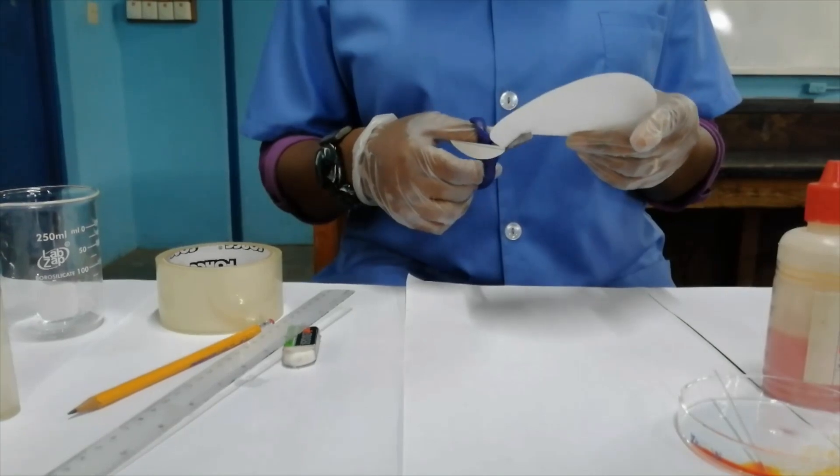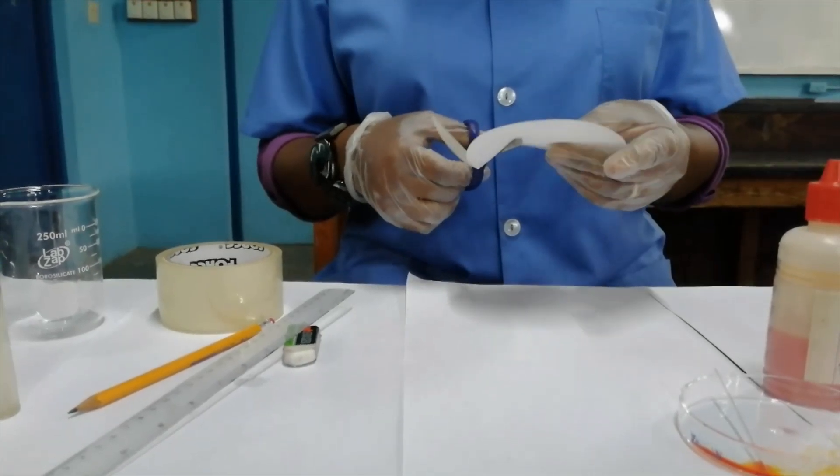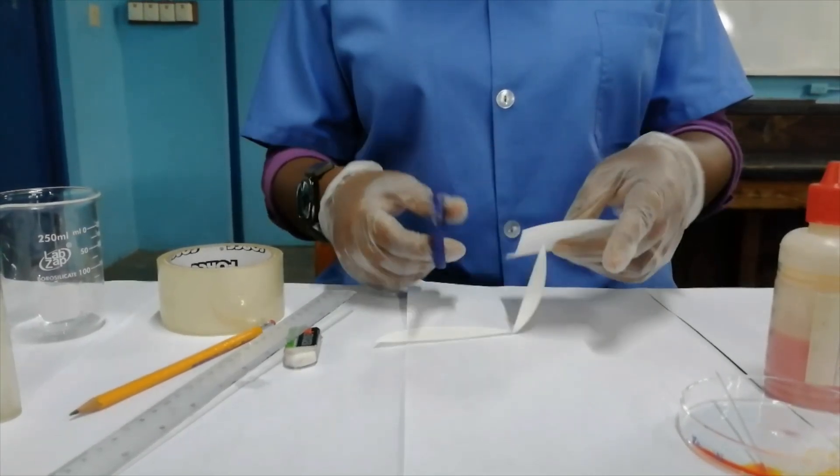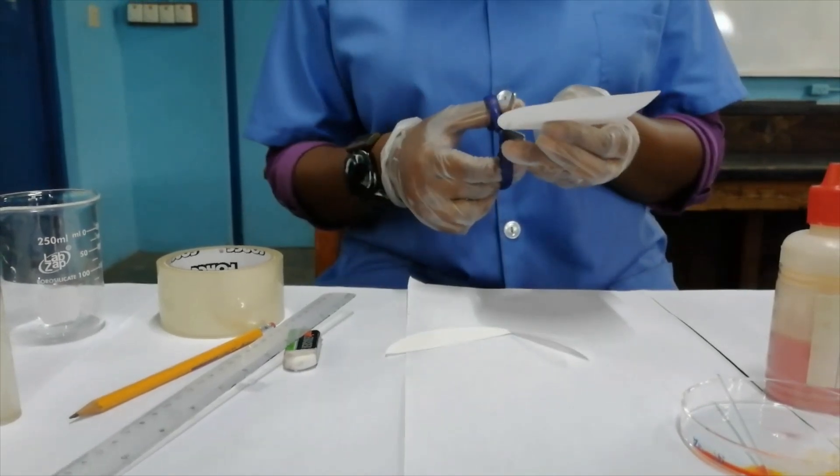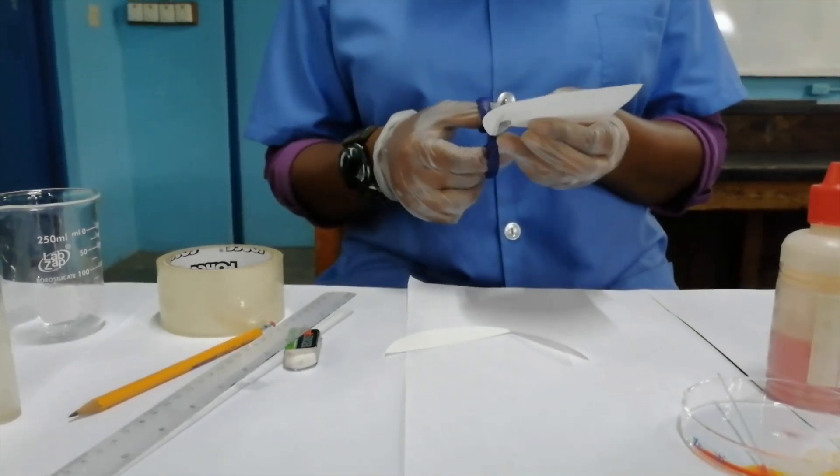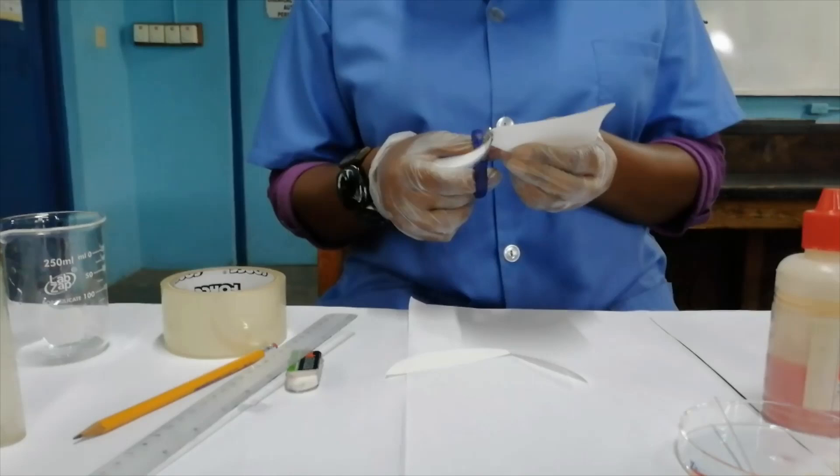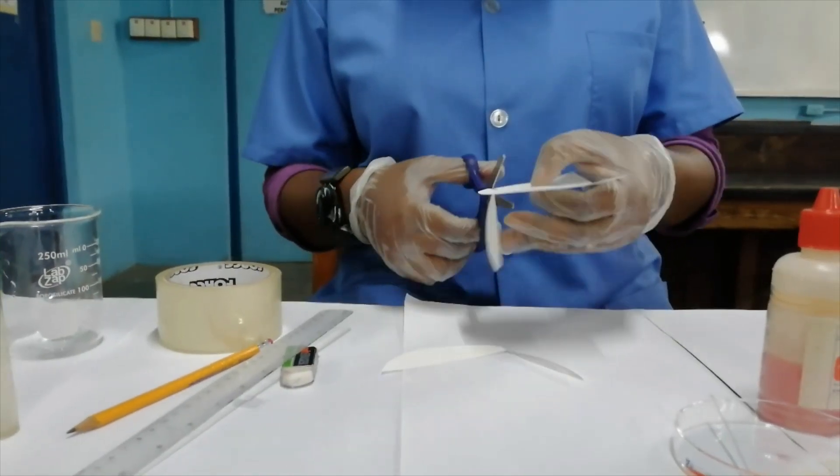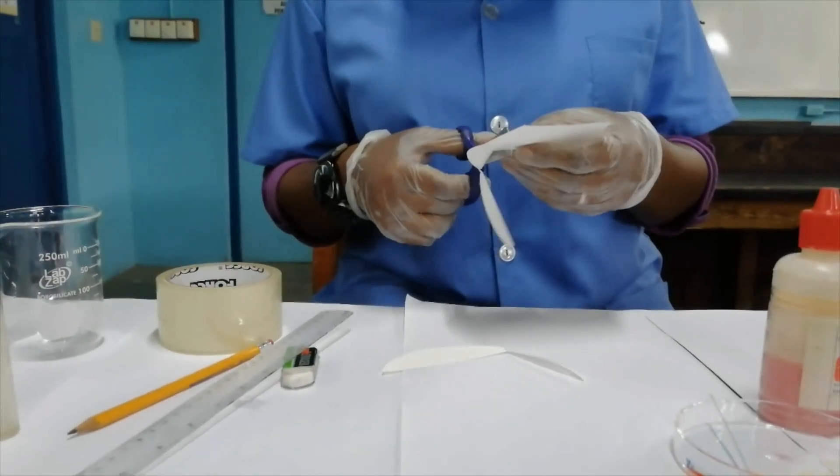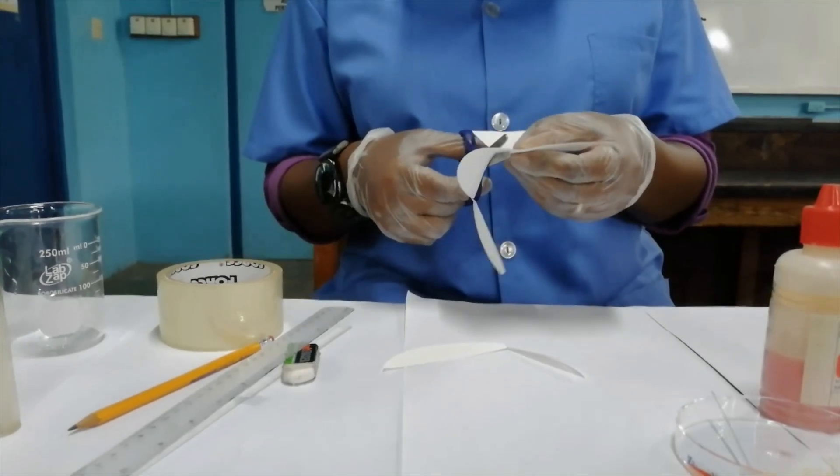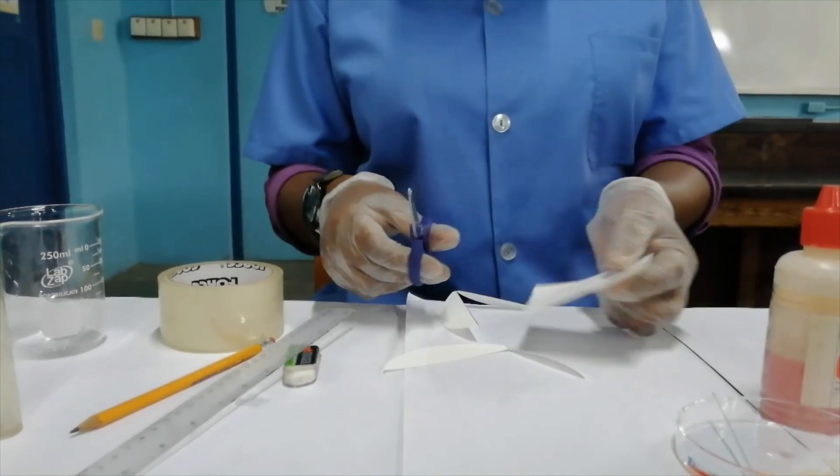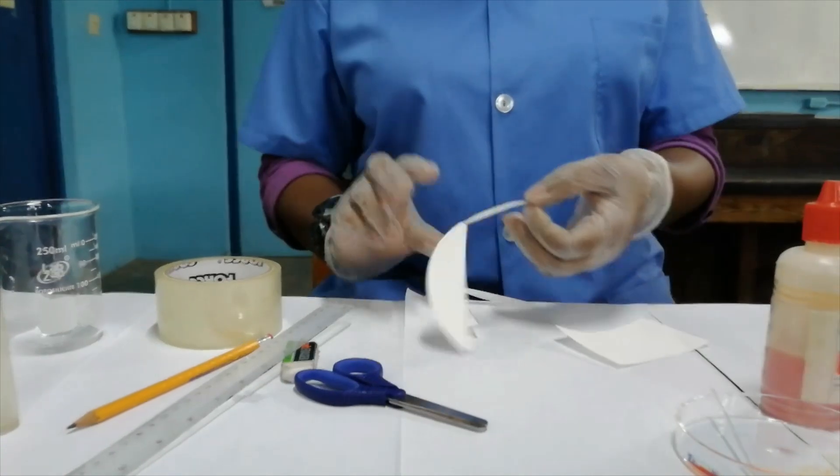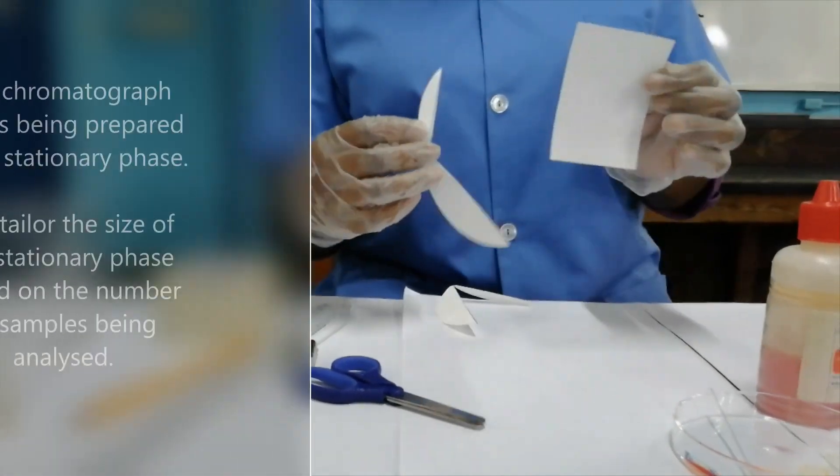The reason we use a pencil not a pen is because if the ink touches water or any solvent it's soluble in, it's going to run up the paper. We do not want that. The pencil has graphite in it and the graphite isn't soluble in water, so you will not have any streaking of the paper.